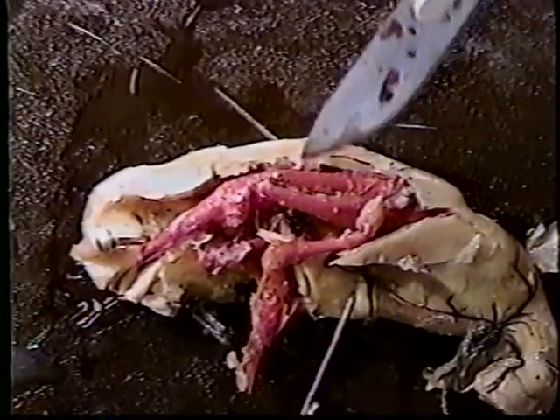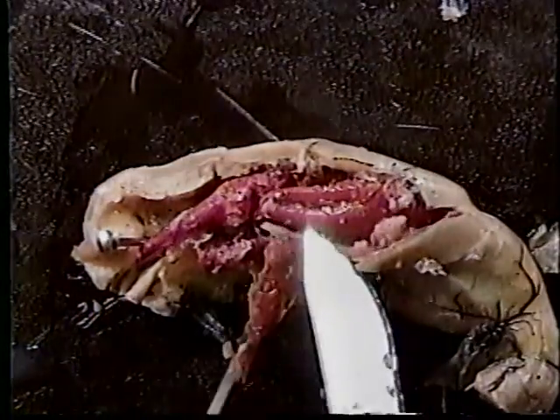At closer examination, we start to get a real feel for the diet of our frog. It is appearing to us as if it was in the midst of digesting some sort of a crab-like organism.